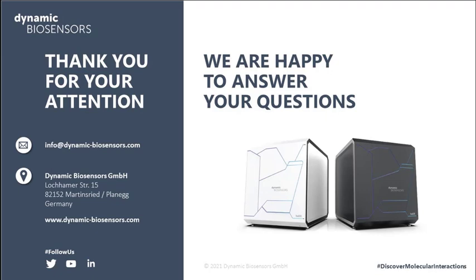Thanks for that question. The typical antigens that we are working with, as we had mentioned for all of these assays, are larger proteins on the order of 60 to 80 kilodaltons, and this is typically the standard size. Our automated workflows are created in such a way that you can select a standard ratio. This is a recommended ratio of your ligand to the adapter strand. It is flowed over the surface, and then you can see immediately from the profile how the kinetic profile or the dissociation profile actually changes. That will give you information as to the amplitudes or the relative ratios of the monovalent to the bivalent engagement. From there, you will be informed as to whether or not you need to increase the density or effectively decrease it by adding adapter strands into the solution mix.